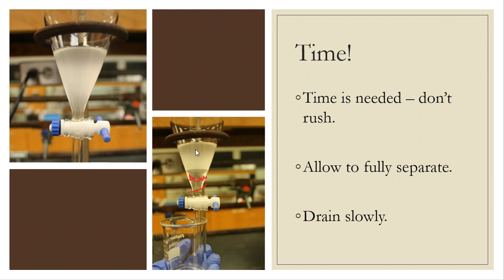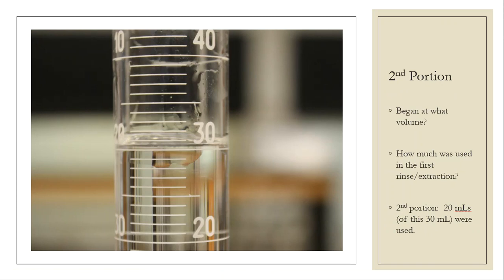All right, so I'm going to slowly drain it. So I open up the stopcock here, and then I drip, drip, drip, drip, drip until I get closer to the cloudy layer. Now notice it's not as cloudy down here, and that's because this is not my final extraction.